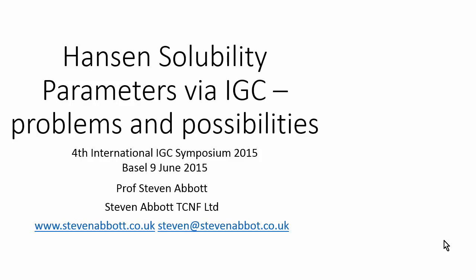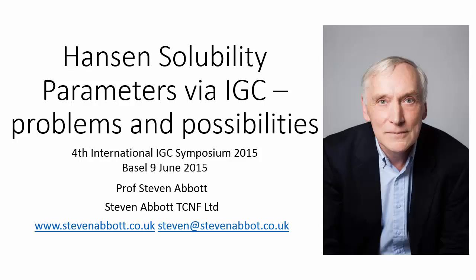I want to talk about Hansen solubility parameters and how they link with IGC, and I want to show a new way in which we can all explore the possibilities of IGC. This is me. Again, sorry that I can't be with you in person.